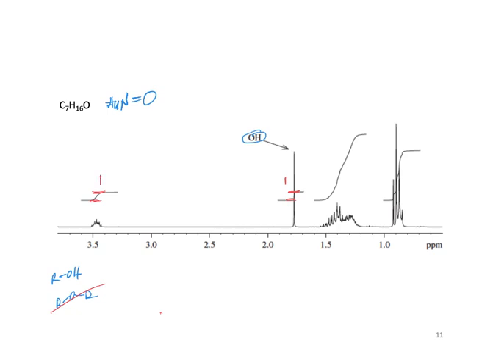So if you have an ether, unless you have a quaternary center on one side of the ether, there should be more protons that are downfield, right? But we have only 1 proton on a carbon next to an oxygen. So if we have an alcohol, we decided we could just draw out the possible alcohols. So could we have something like this? No, because we only have 1 proton there. Okay, so this likely means that it's a secondary alcohol.